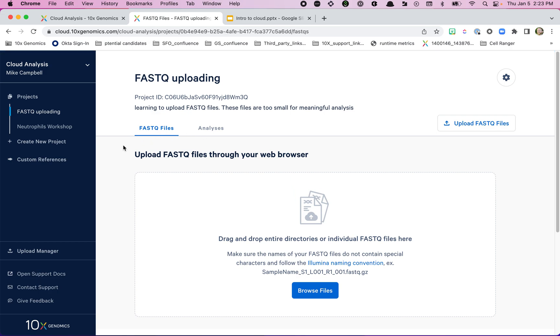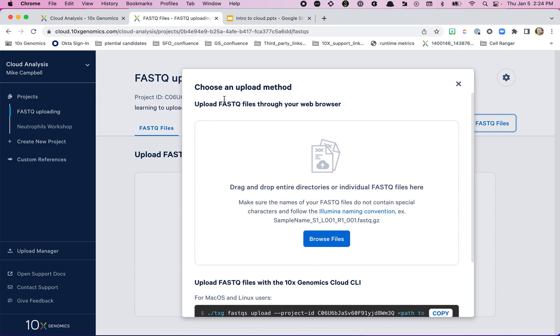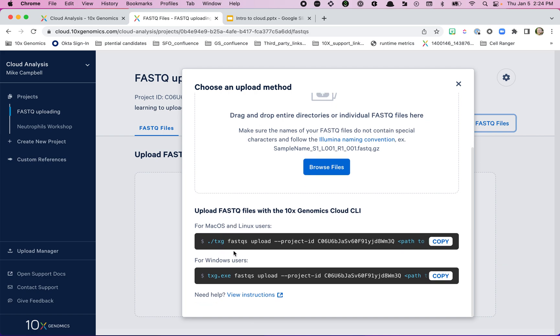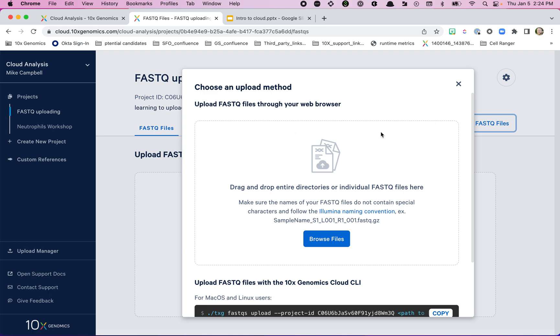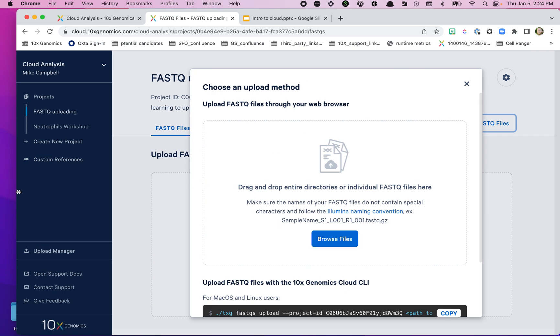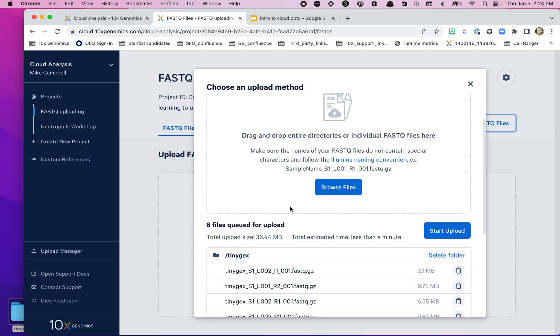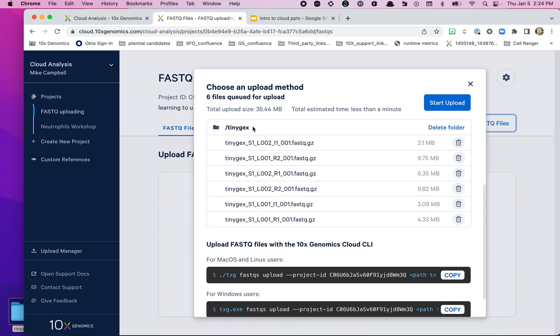Once I create the project, it automatically takes me to FASTQ uploading because it knows you need to upload your data first. I'll click 'Upload FASTQ Files,' which opens a box to choose an upload method. We can browse on our system, use the command line interface, or drag and drop. I'm going to drag this folder for my tiny gene expression files into the upload area, and it will show me a preview of what's in that folder.